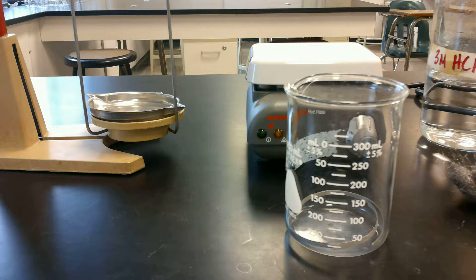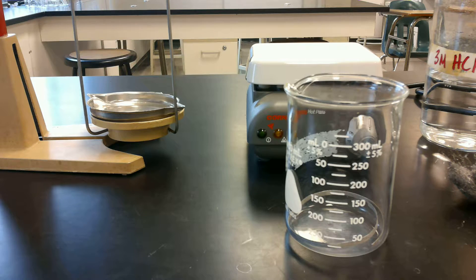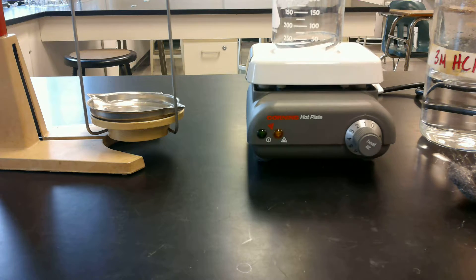And so while you're waiting for that to dissolve, after it dissolves, you're going to take that labeled beaker, and you're going to put it in a hot plate under the fume hood. And it should be completely dissolved by this point. If it's got just a little bit left, as it's heating up, it'll probably be able to dissolve the rest of it. But it really needs to be pretty much completely dissolved by that point. And then while it's heating, you'll be able to come back to your lab station and most likely do the pre-lab questions while you wait.